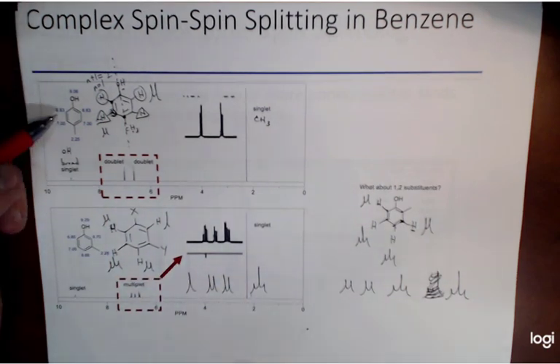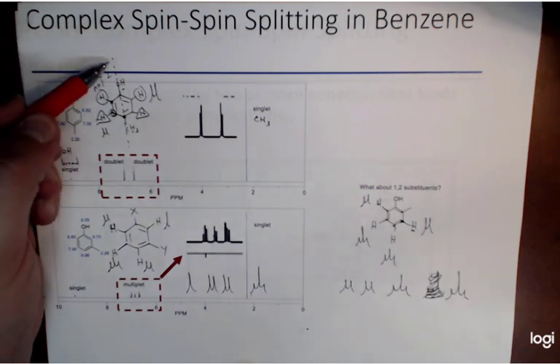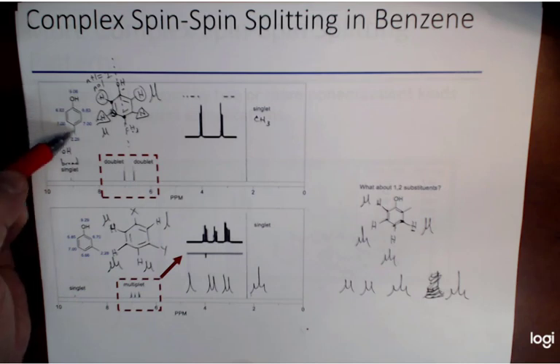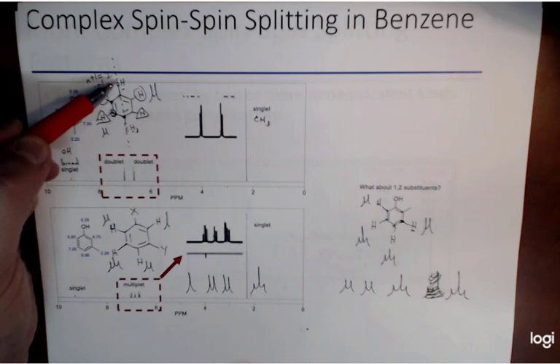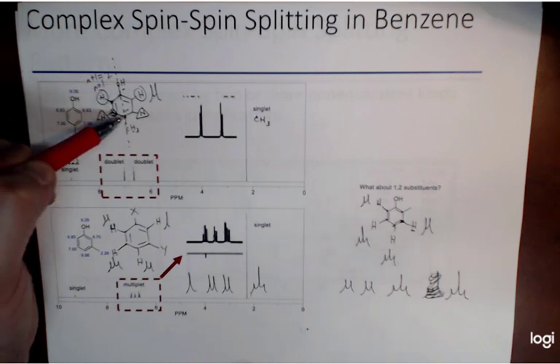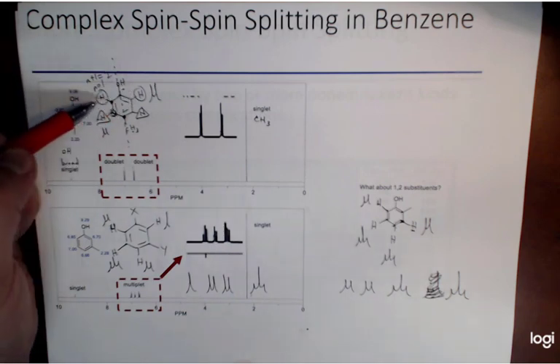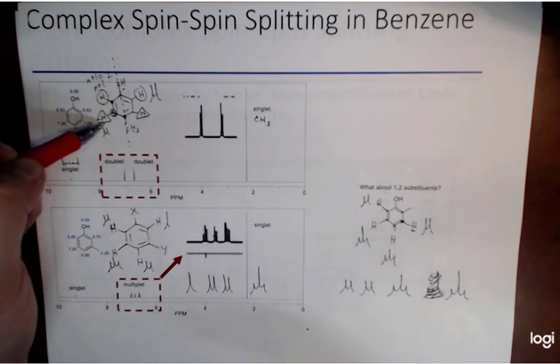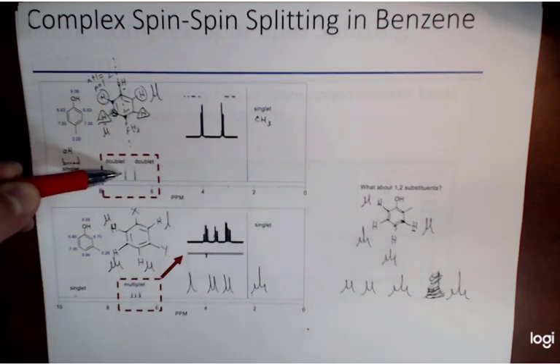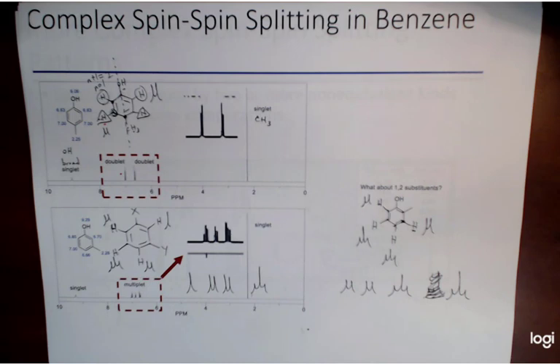Now, however, when we look at the hydrogens that come off the ring, based off of plane of symmetry, this 1,4 substituted benzene only has one plane of symmetry going here, cutting through the oxygen-carbon bond and the carbon-carbon bond. What that tells us is these top 2 hydrogens are equivalent, and these bottom 2 hydrogens are equivalent. So really we're only going to see 2 signals in that aromatic frequency, in the 6.5 to 8.5 range.